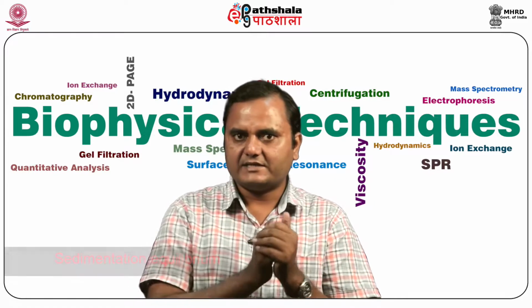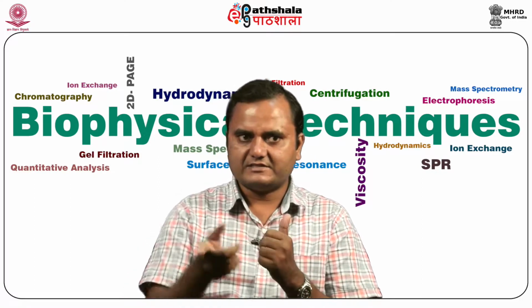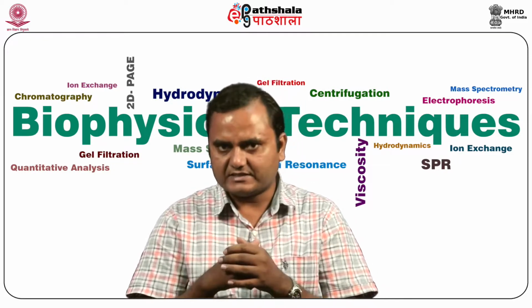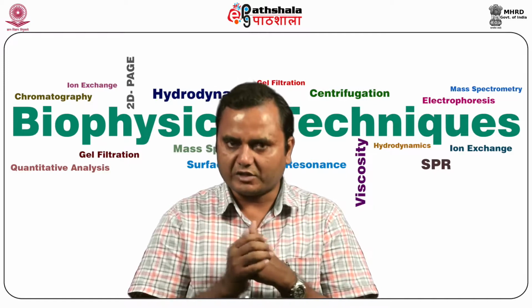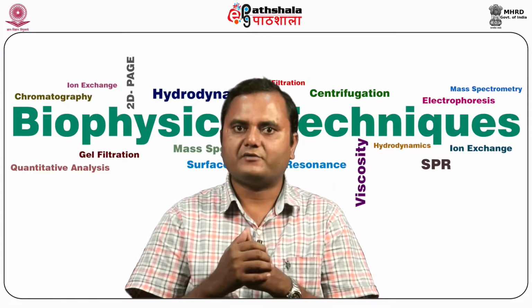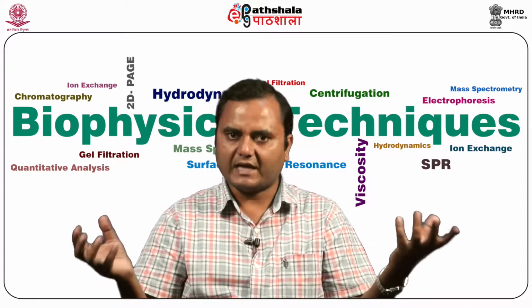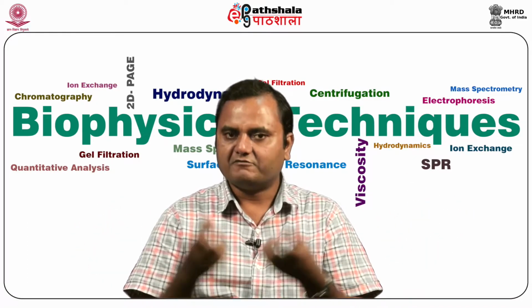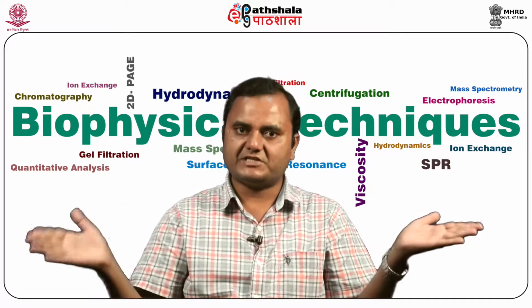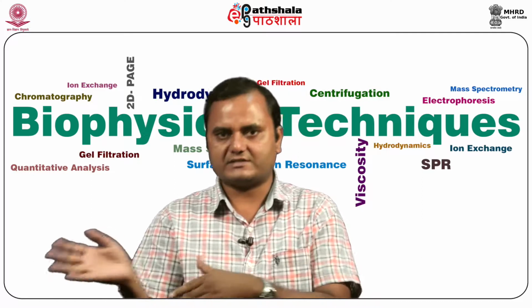The other part is sedimentation equilibrium. So, sedimentation velocity, and the next is sedimentation equilibrium. In sedimentation equilibrium, it is also used for the measurement of molecular mass and subunit stoichiometry. It is useful for the measurement of the equilibrium constant for heteroassociating systems, like how two systems are capable of associating together, what the binding constant and equilibrium constant are, under what condition this equilibrium is changing, and this equilibrium is shifted towards the aggregation side or towards the monomer side.